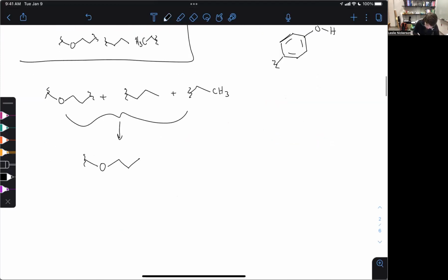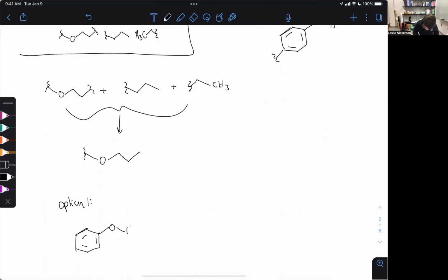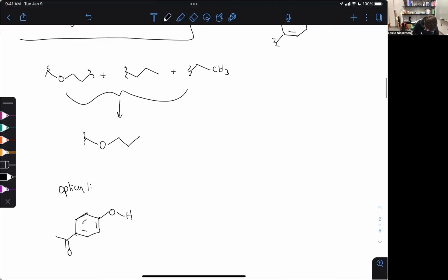So let's draw up a couple options. Okay. I would say these are two very reasonable options.